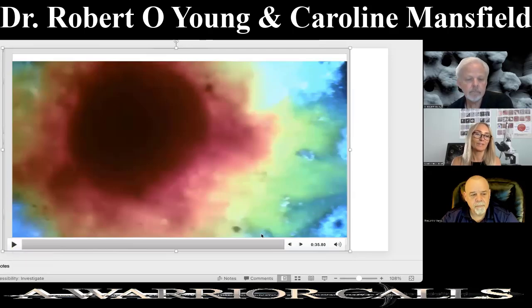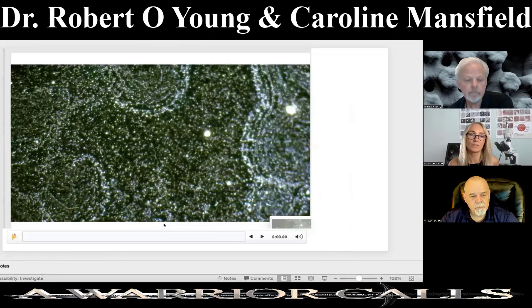And there's one other thing I want to show you in another video. This is a flower remedy. So this is basically dew from a flower. This is what the product is. It's morning dew. And look at the beautiful pattern that created in the background on the slide. So when people say they're looking at something and they say, oh, it's creating all this nanotech because there's a pattern, in nature we have patterns that can also form. This also shows that there's a molecule that keeps coming back to check on this molecule that's just static, or at least it appears that way.